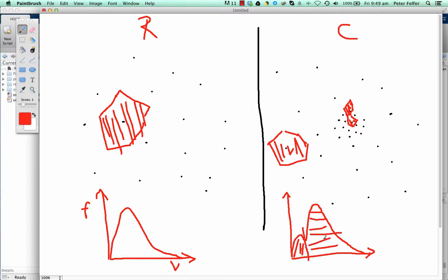As you can imagine, we've got these histograms, so that makes it fairly straightforward to automate the whole process. If you have clusters in an atom probe data set, or if you have a grain boundary and you want to create an object from that grain boundary, or you might have a thin film and you want to create an object from the gate oxide, then it's really a one-click process to get your data filtered.